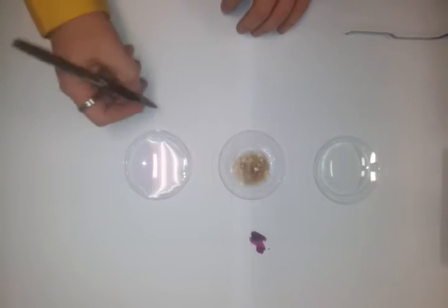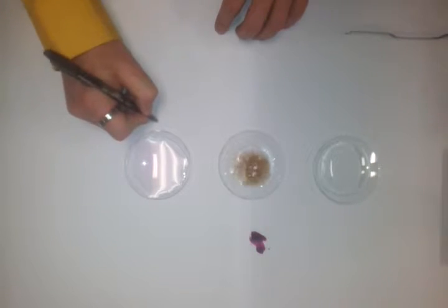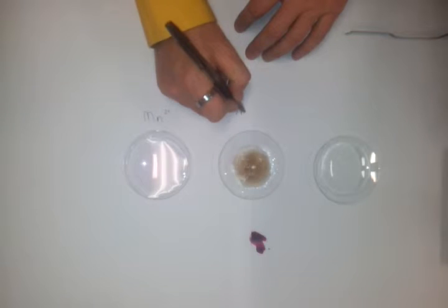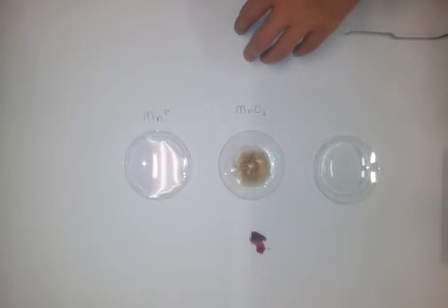So in this one, we've made manganese. I'm sorry if the writing's not particularly clear, but I'm doing it upside down. Manganese 2+ was our product there. In this one, our product was a little bit different. It's manganese dioxide. All right.